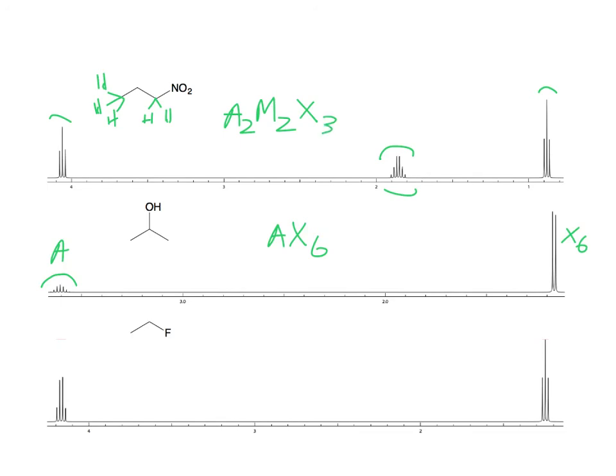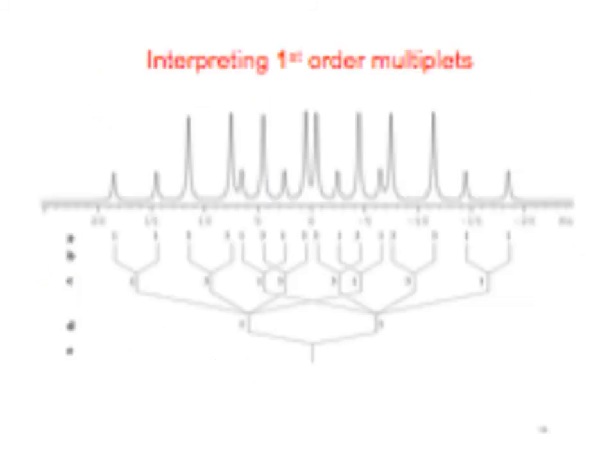I guess that looks kind of weird, but and then this is the kind of a standard ethyl group, right? So A2X3. Yeah, these are all beautiful looking. You always wish that you could get one looking that good. No water peaks. All right. Well, let's just stop here before we start to look at some of these other multiplets. But yeah, these are pretty clean too.